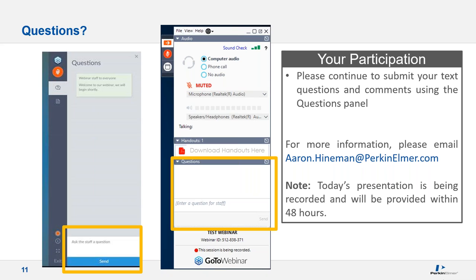In that case, what we've generally done is use an argon humidifier because it could be a very high solid, so we want to keep things from depositing. And because those types of samples can be very corrosive, we tend to also use a ceramic torch. Even if you're using a high flow for your plasma, those samples are so corrosive, they're still going to eat away quartz torches relatively fast. Yeah, good point. For the really high salt content samples, fusions, the ceramic torches are really nice. They save you having to do extra maintenance and torch replacements.